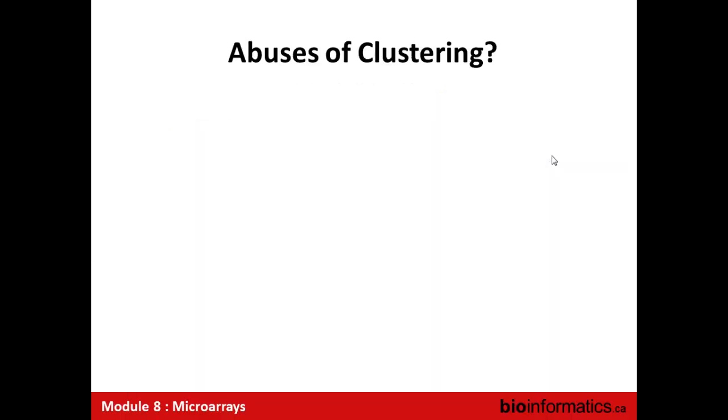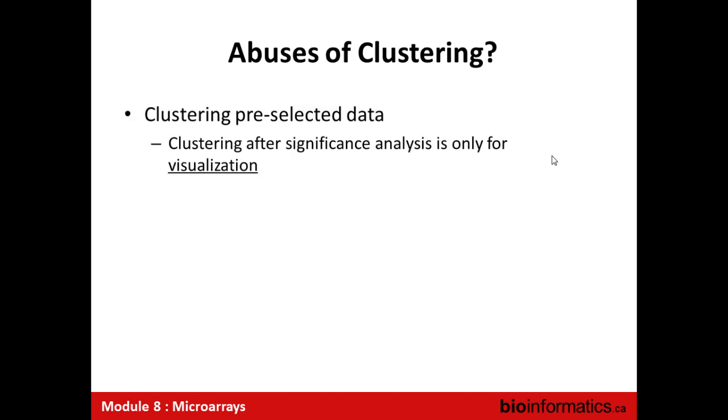That being said, clustering is a very widely used thing. I said it's overused, and some of the uses are terrible. I cannot tell you the number of times I will show a heat map, and then somebody, I don't want to say a clinician, even though it is often a clinician, will point and go, these are the genes that I want. And you go, well, we'll do a statistical analysis to figure out if any of them are statistically significant.